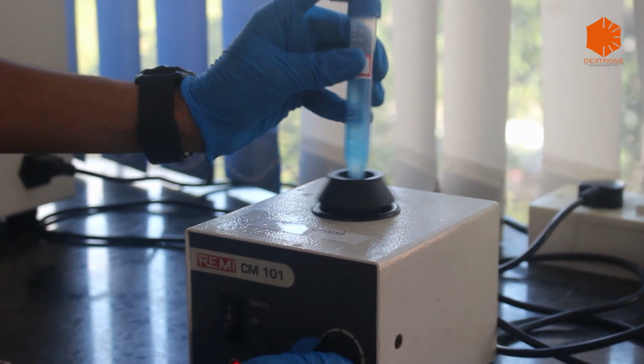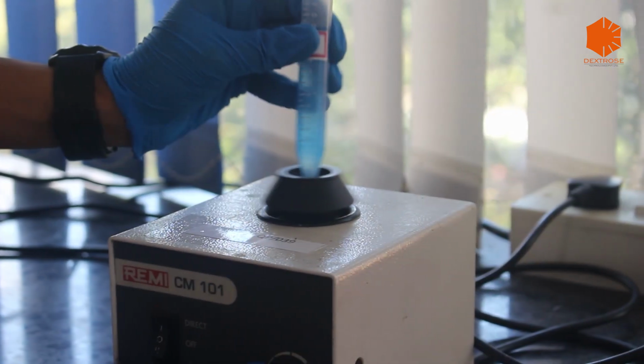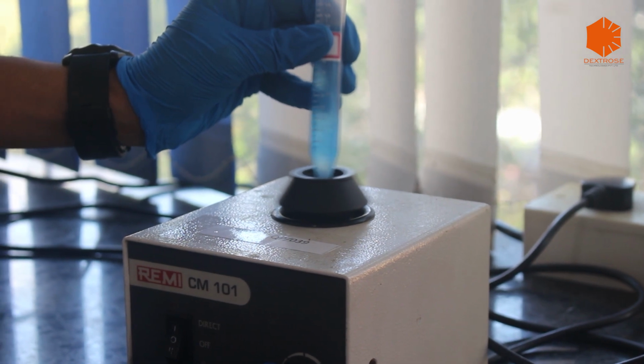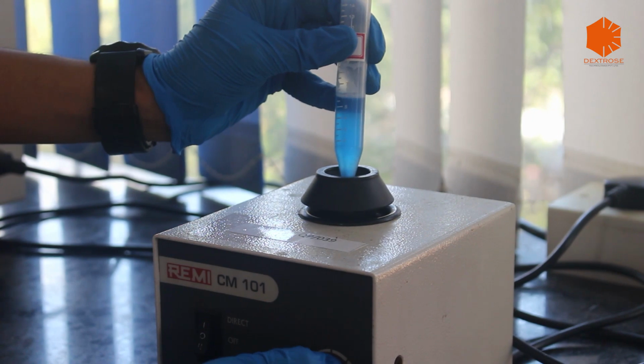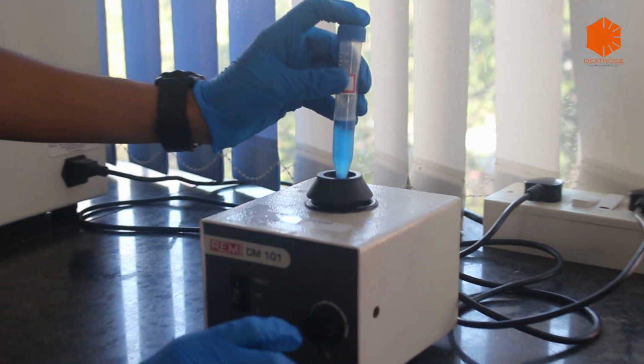The swirl flow pattern is created, as you can see, for the uniform mixing. This is how the mixing happens in a vortex mixer. Now slow down the speed.